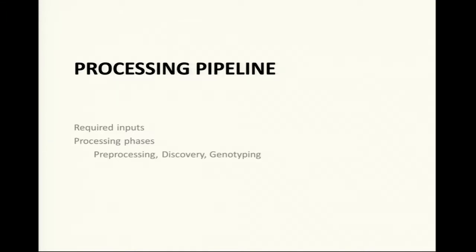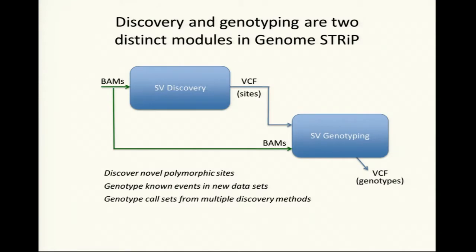So I'm going to talk a little bit about the processing pipeline. There's a lot of code snippets in here, which I'm not going to dwell on in the interest of time, but I want them to be in the presentation because this presentation also gets used as a sort of resource later, where people can look at examples and example pipelines and pieces of code.